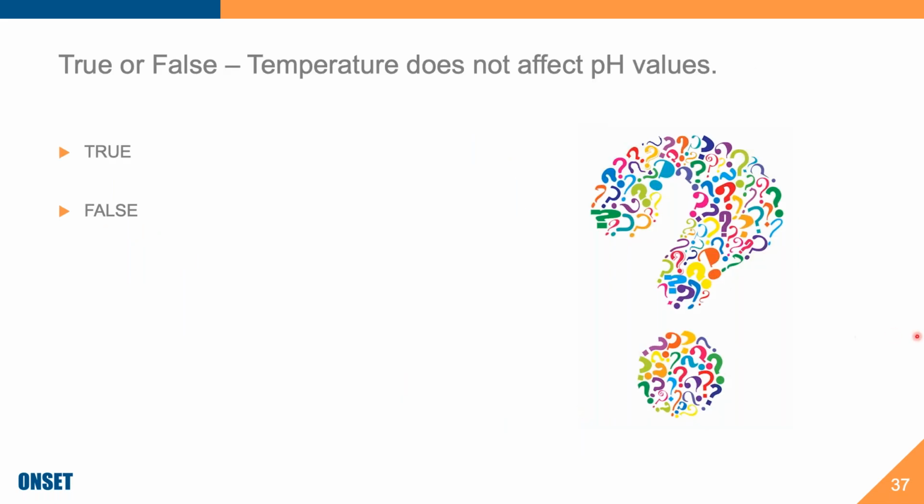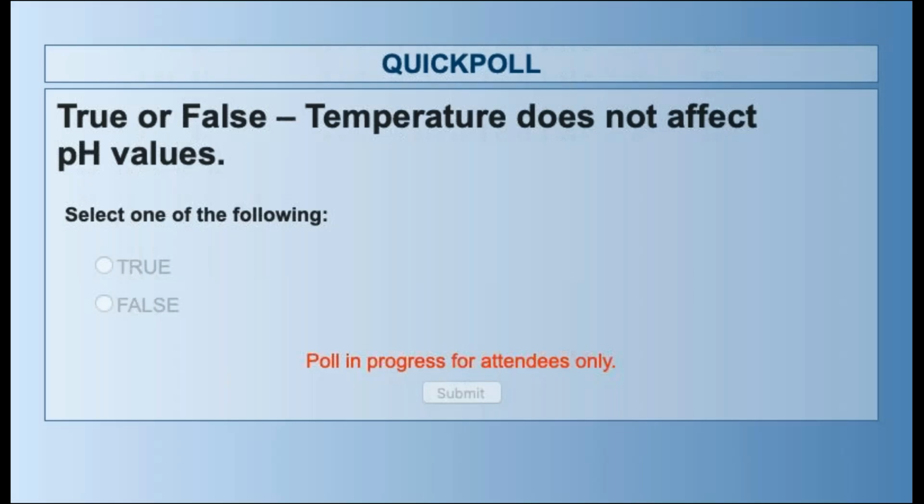Okay, one more poll for you guys. True or false, temperature does not affect pH values? I'm going to let you answer that. This will be a quicker one, I think.